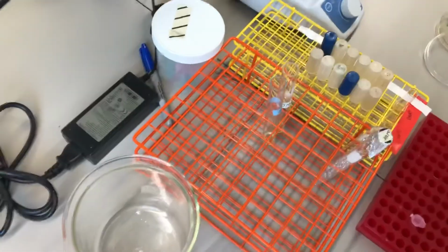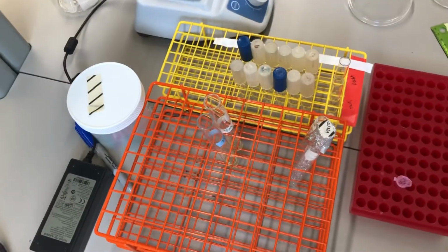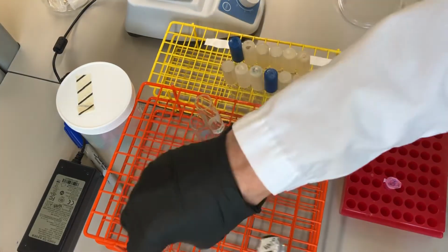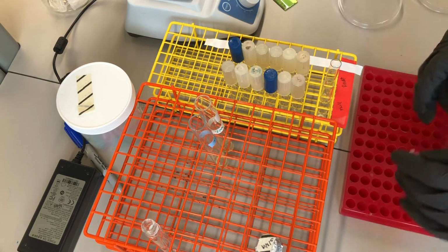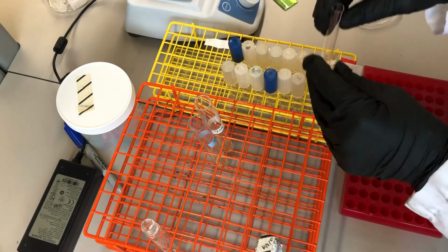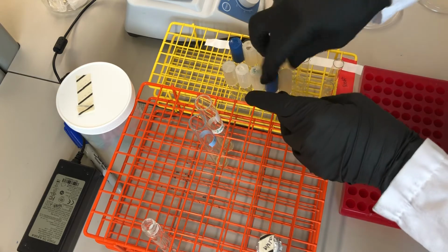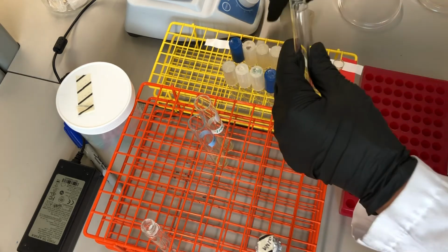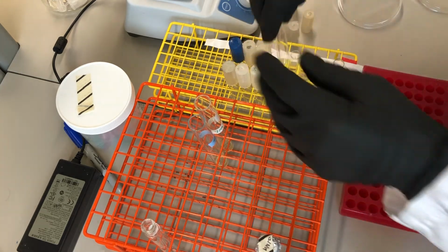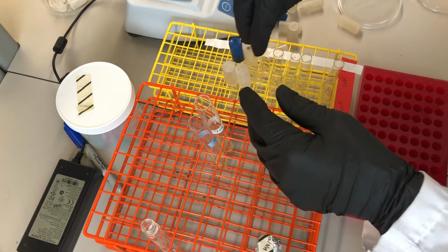Okay. Now we can continue setting up the dilution series here. The reactions are proceeding, and your tubes already may have the caps removed, depending on how the staff prepares the tubes for us.